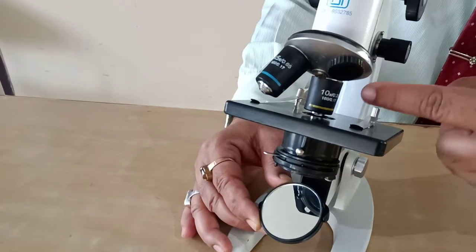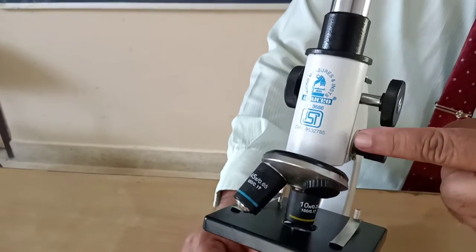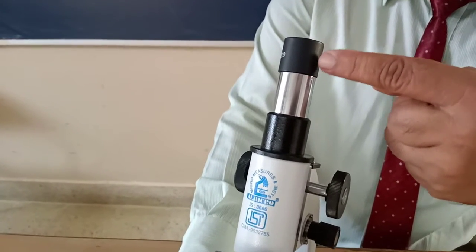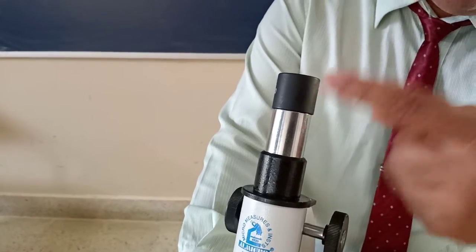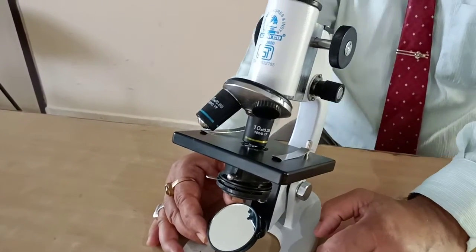Light passes through the object, then through the objective lens. Through this way it comes to the eyepiece, the lens placed just below the eye, so this is called eyepiece. Okay, so this is for reflecting the light. Without light we cannot visualize the object.